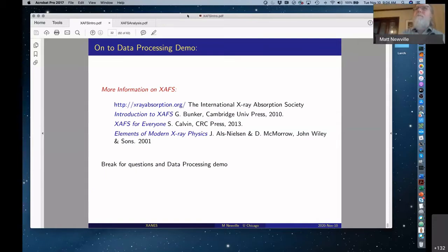Okay. Well, at my beamline and many beamlines, we measure XANES and sometimes extended XAS at 10 to 50 ppm on a regular basis. It always matters what the other million ppm are. So you can do 10 ppm of iron in water or in a biological system, but you can't do 10 ppm of cobalt in iron metal. In iron, yeah. Okay. I don't think I have any data for that.